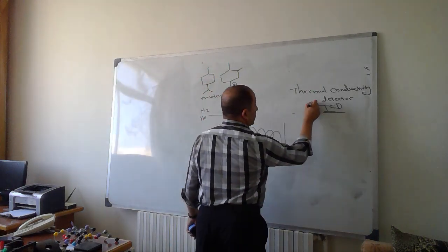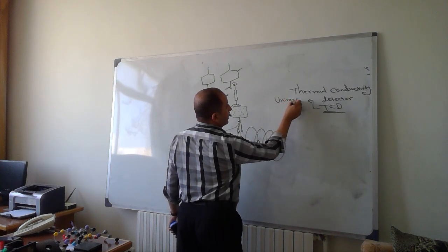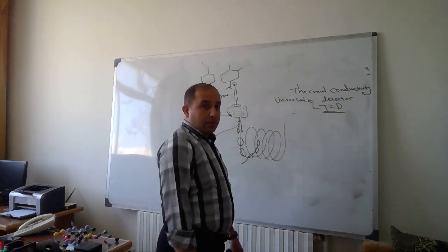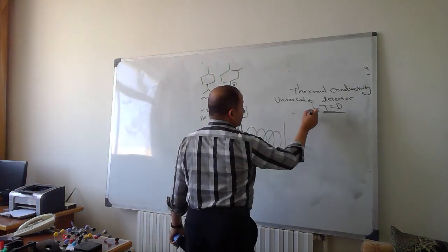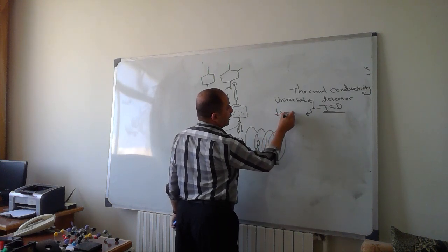It has the advantage of being universal. Universal, we mean it is suitable for more or less all compounds, but it has the disadvantage of low sensitivity.